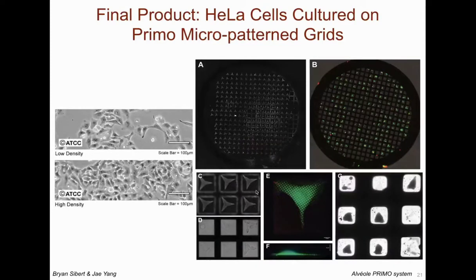the triangular pattern was generated for several reasons. First, to replicate the basal level order that HeLa cells tend to have under standard cell culturing conditions. Note their semi-triangular order of the individual cells. And second, to orient the spreading cells to the central regions of an EM grid square. As can be seen, this pattern supports the even and regular distribution of cells across the entire EM grid, as you can see in panel B.